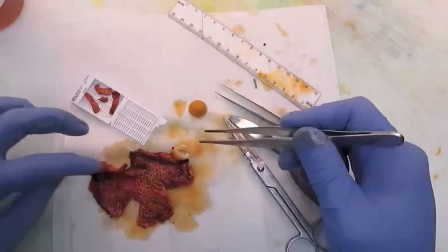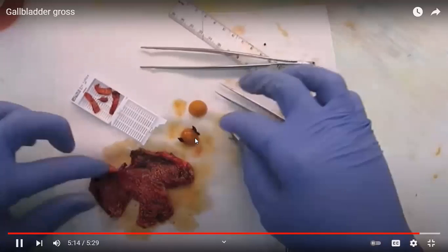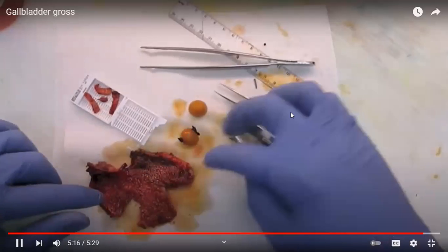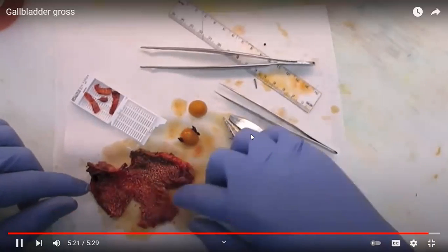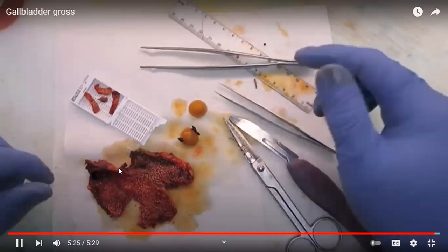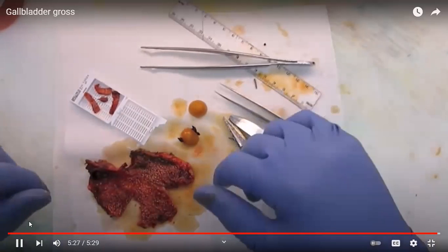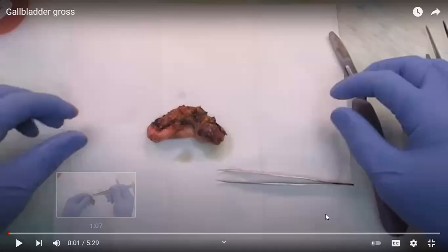And that's common when there are a lot of stones. So that's something that we comment on if there is. And usually, so ito yung dissecting set niya, no? Forceps, scissors, the knife, blade. That's pretty much it for the gallbladder. Okay, so that's it. So let me stop the recording.